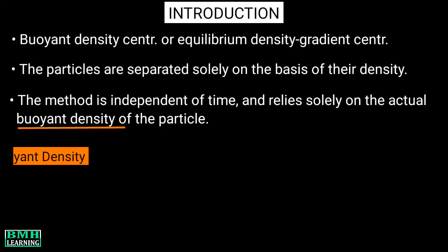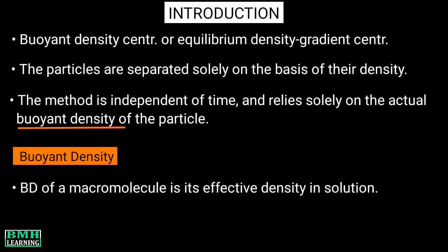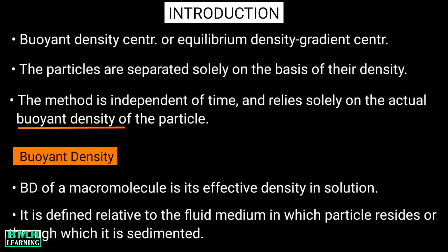Now, what is this buoyant density? The buoyant density of a macromolecule is its effective density in solution. It is defined relative to the fluid medium in which it resides. We can say the medium through which it is sedimented. Now let's get into the details of this method.